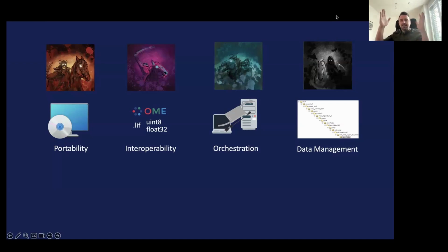What is a bit different is that, as far as I know, ICY runs everything on your computer. And it is Java based, so it's sometimes a bit hard to add plugins, but the idea that it all runs on your computer is a big benefit. But for example, if you want to connect your microscope or a GPU server that sits somewhere else, you're not really able to do this. Arkitekt offloads tasks to different hardware in your lab or somewhere else. So that's the main difference that I would say.